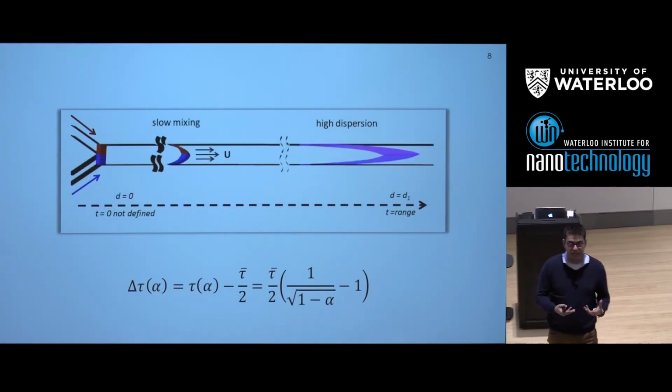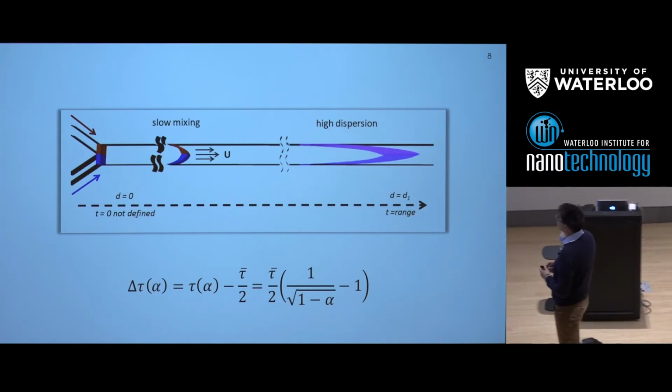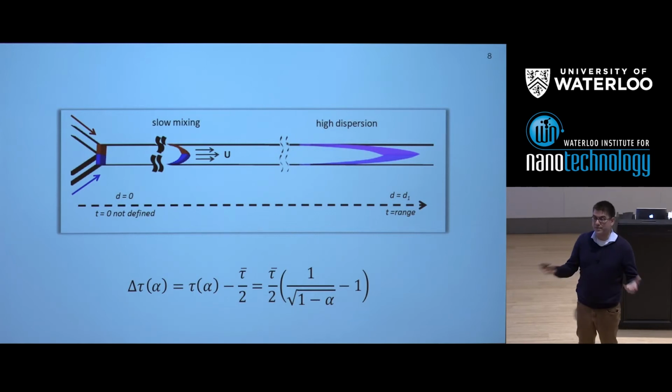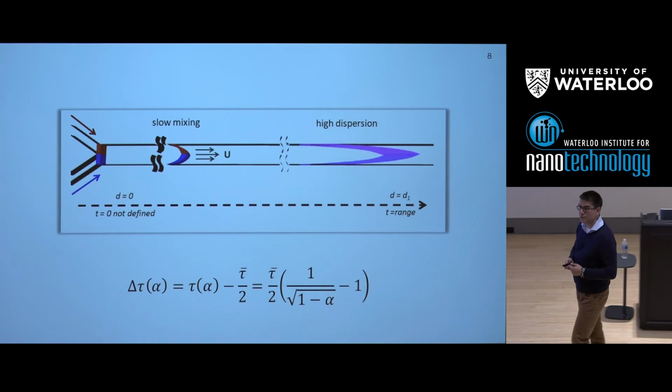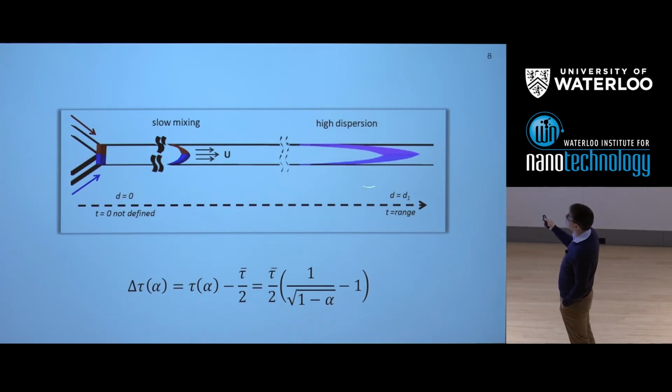detection and control techniques with microfluidics to do a good job, but we have a big problem. And that problem relates back to basic chemical engineering. The idea of pushing fluids through small pipes using hydrodynamic flows always gives us this problem here, and that problem is dispersion.